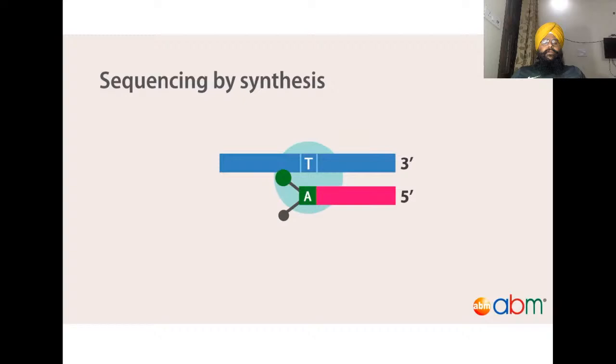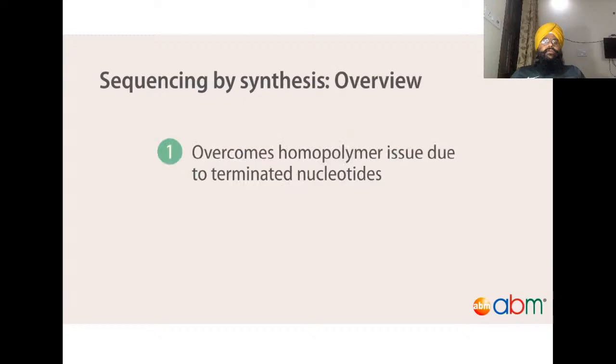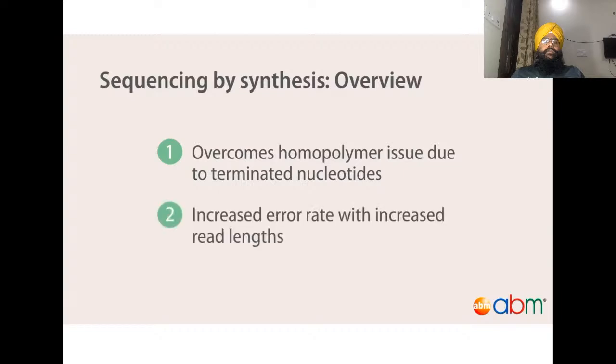This system is able to overcome the disadvantages of the pyrosequencing system by only incorporating a single nucleotide at a time. However, as the sequencing reaction proceeds, the error rate of the machine also increases. This is due to incomplete removal of the fluorescent signal, which leads to higher background noise levels. Our NGS, an introduction knowledge base, provides more technical details about this technology.